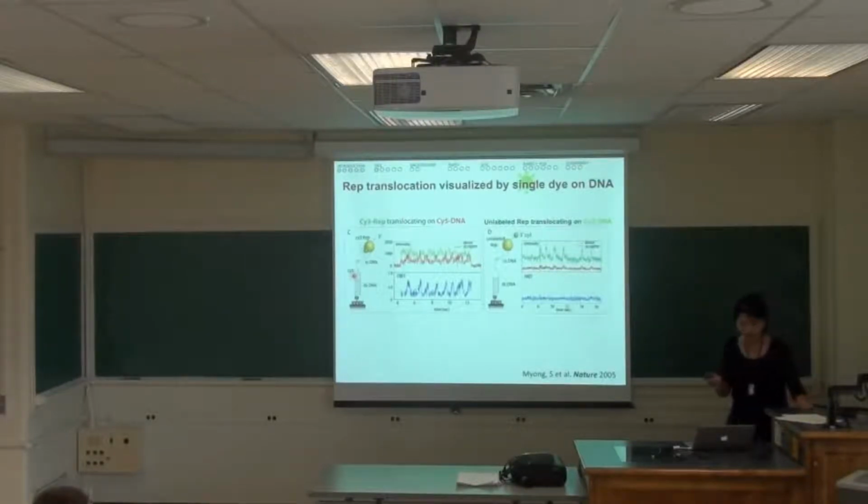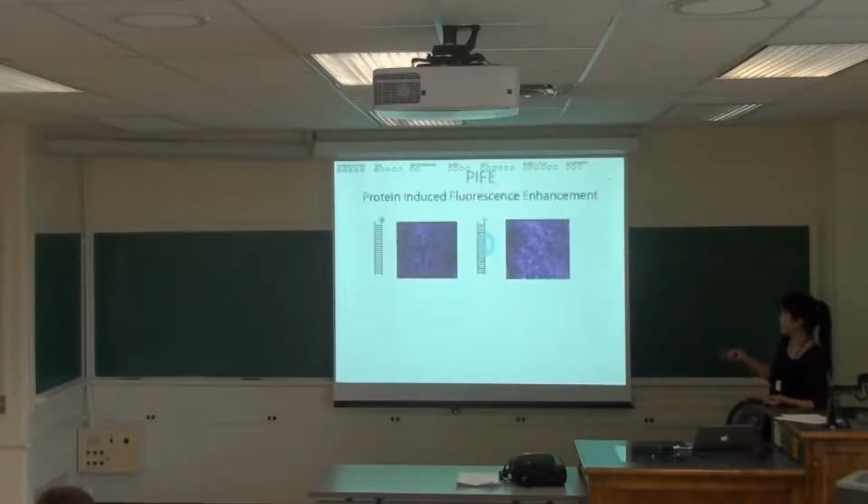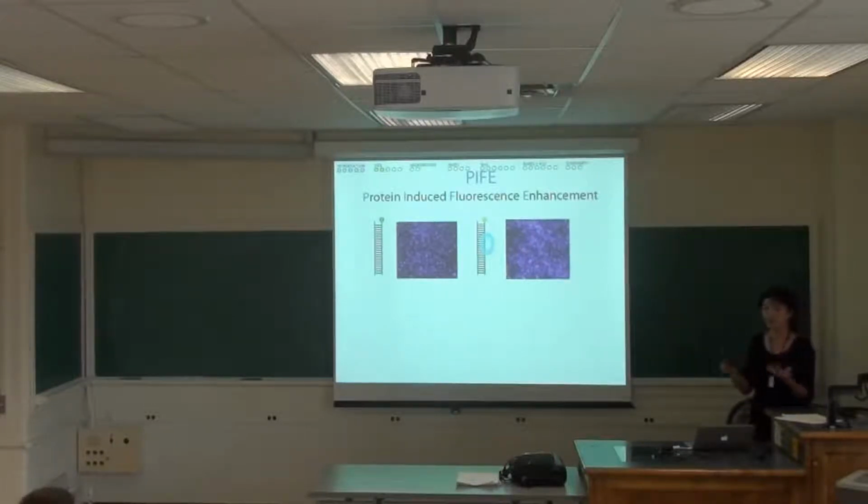Okay. If you have questions, again, I'm briefly going over this PIFE method. We named this PIFE, or PFA, for protein-induced fluorescence enhancement. And the name has a definition: the protein actually enhances the fluorescence of a dye.